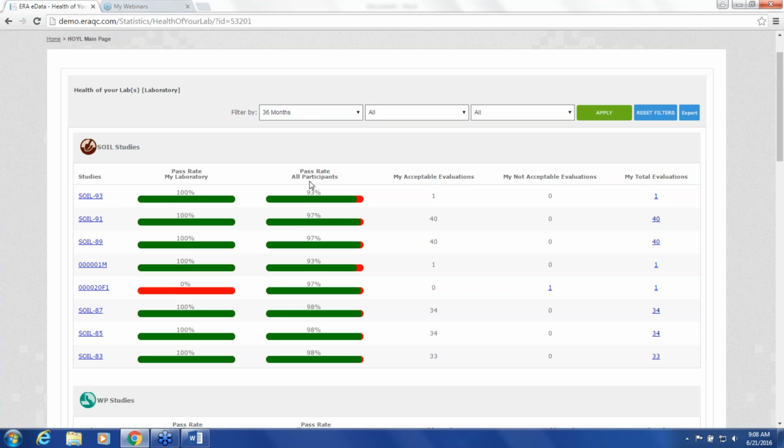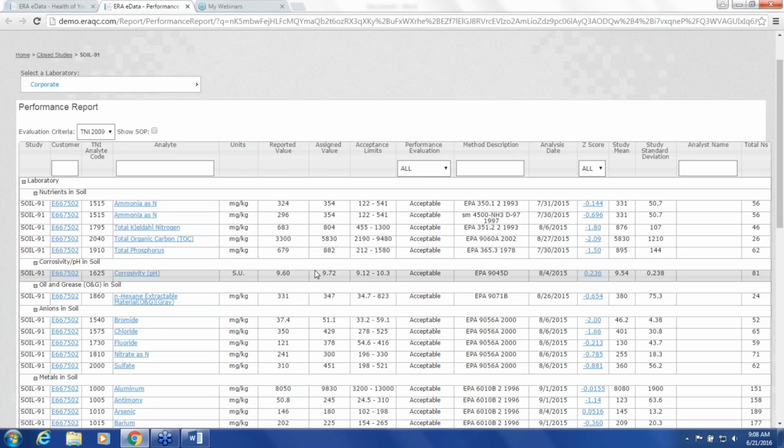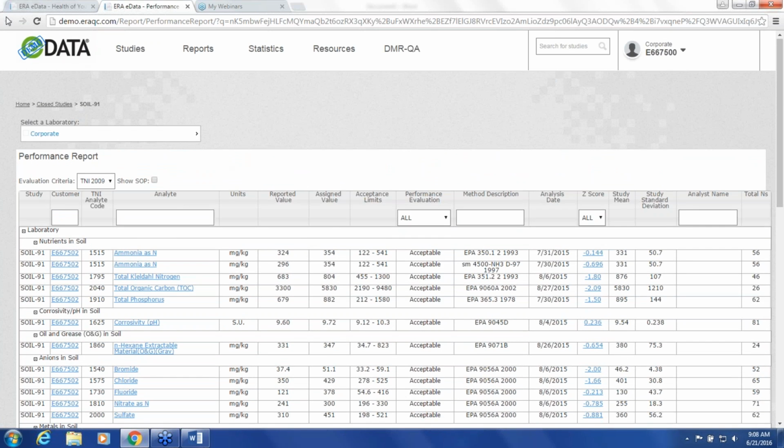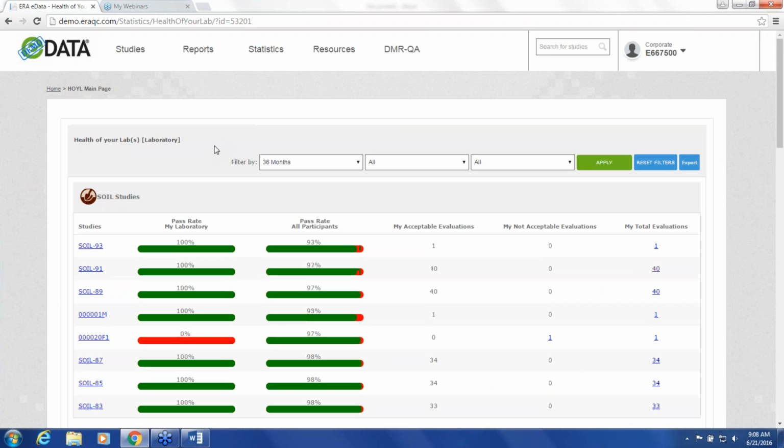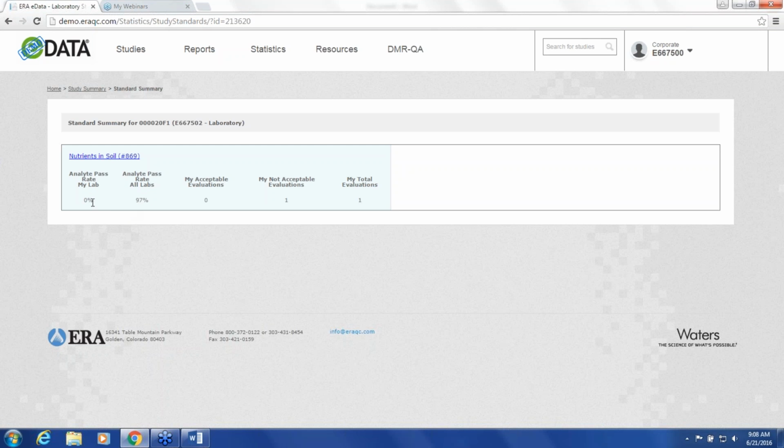Okay. This report also will have links to, you can see all of your evaluations. And you can view some other useful information from this. You can click on anything that's indicated as a problem to drill down further to find out what was going on with that study.